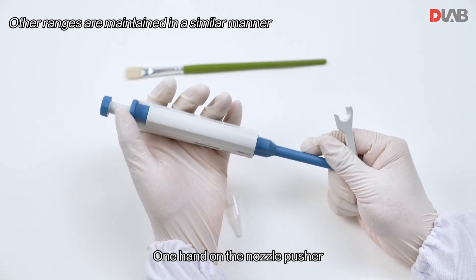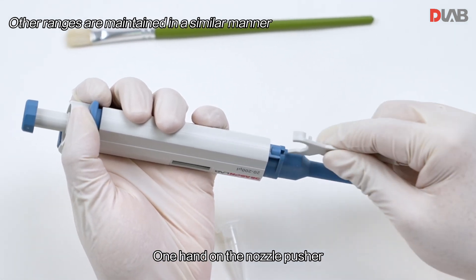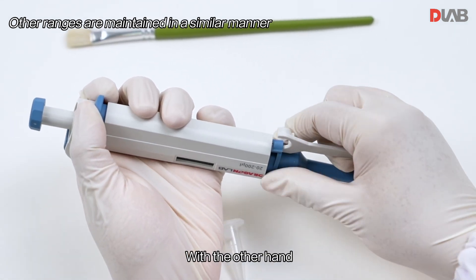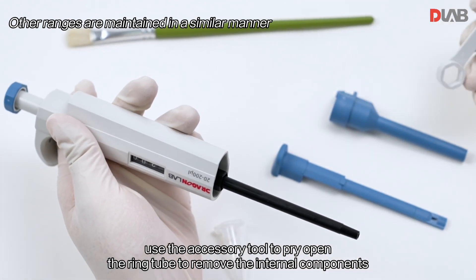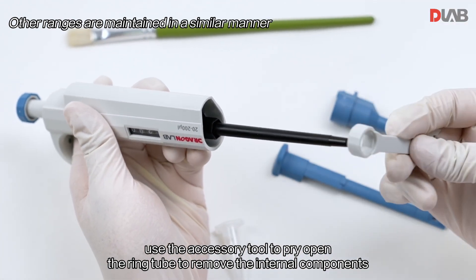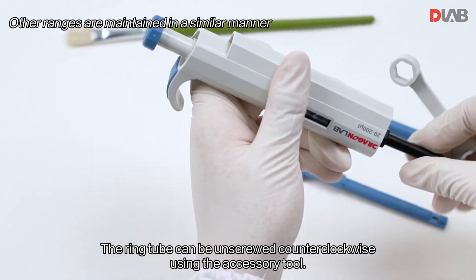With one hand on the nozzle pusher, use the accessory tool with the other hand to pry open the ring tube and remove the internal components. The ring tube can also be unscrewed counterclockwise using the accessory tool.